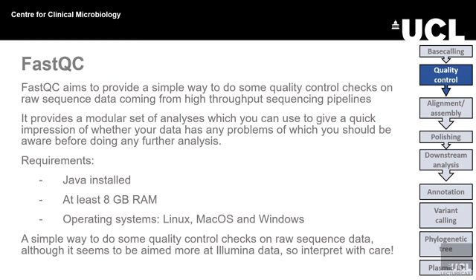As I say, if you're doing a PCR based kit, your DNA is all going to be roughly the same size, about 3 kb. If you're doing native DNA, you might find you've got some that are only a few hundred and some that are hundreds of thousands. So you just have to be aware of what you put in when you look through the quality check output.